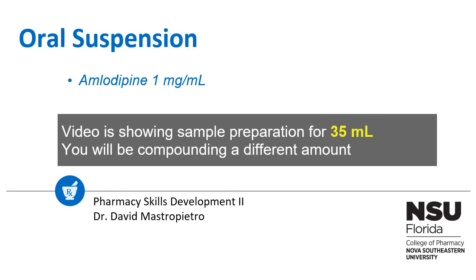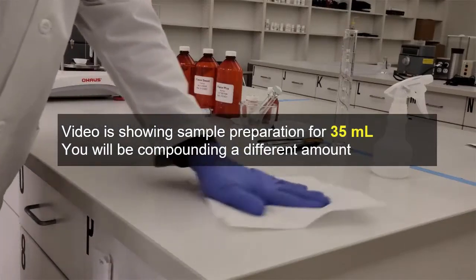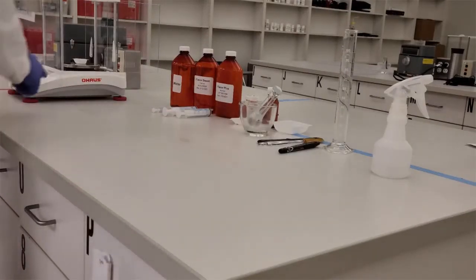Okay, we're going to be compounding an Amlodipine Oral Suspension. This video is for 35 mLs. You are not compounding 35 mLs, so don't go by the numbers you see in the video.